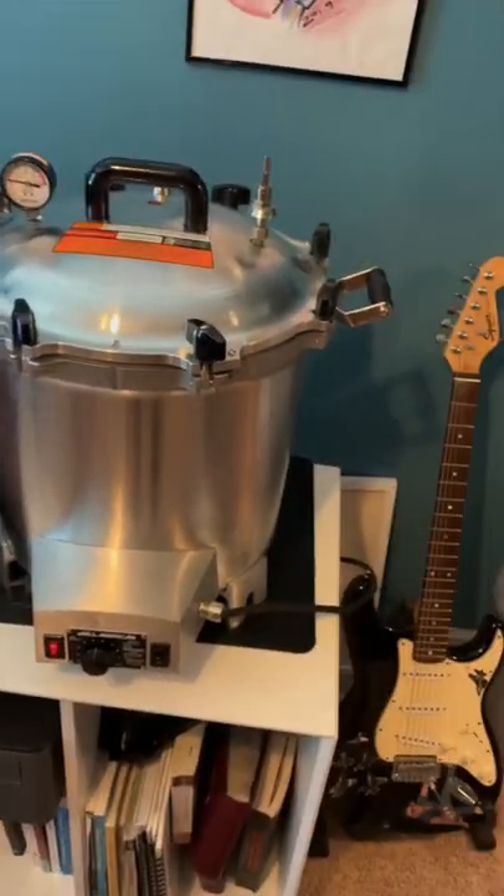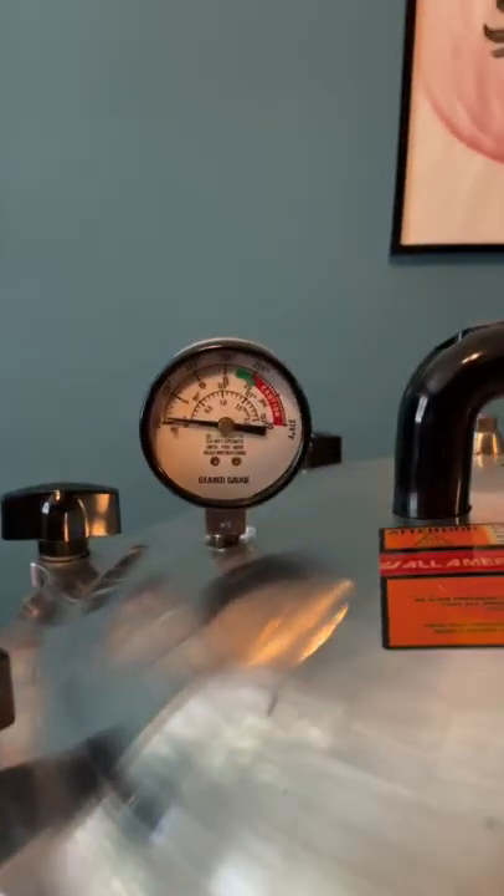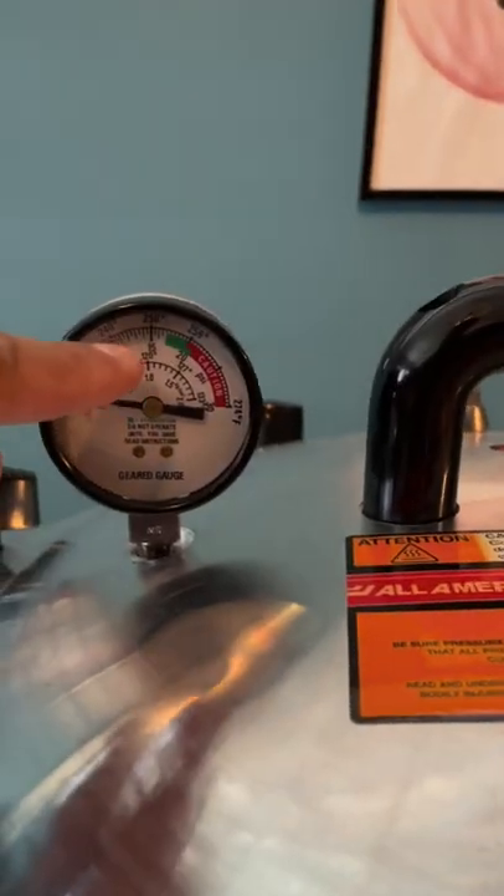Hey, good morning, Carlos here from Happy Little Fungi, and I just wanted to show you a little bit about how we make your sterilized grains. This is an All-American autoclave, and it gets up to 30 PSIs, but your grains, they'll get up to 15 right now.